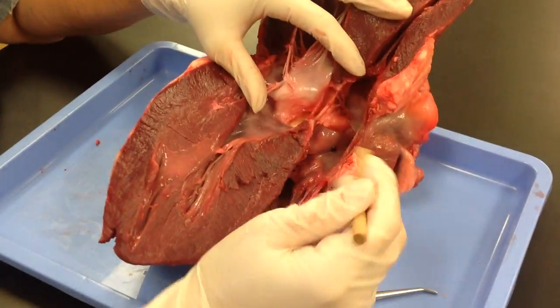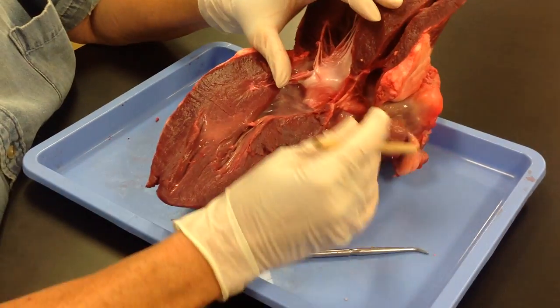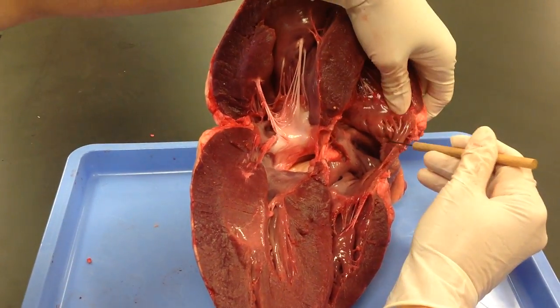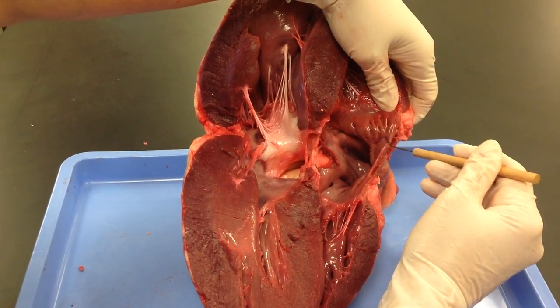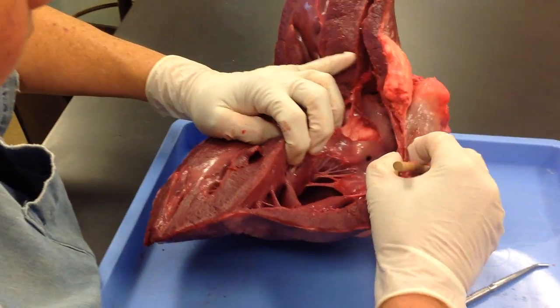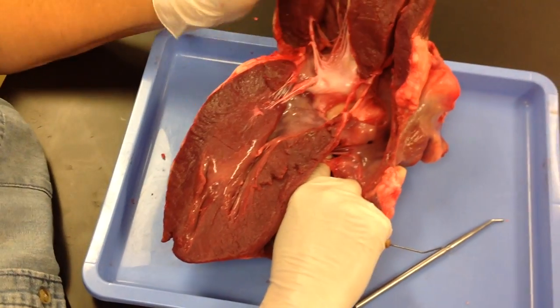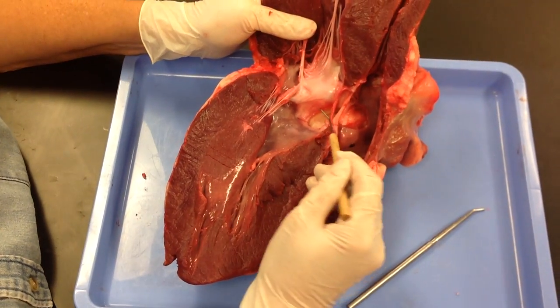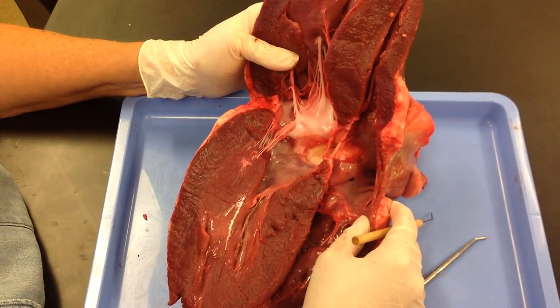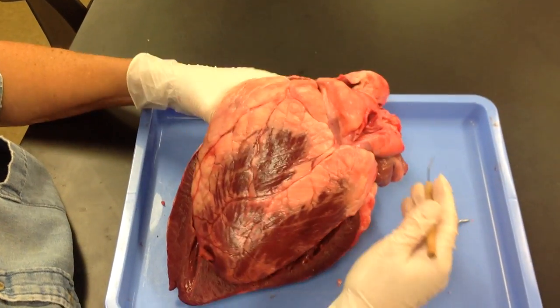On the right side, you have your tricuspid valve and papillary muscle. You have your right atrium up here. This atrial wall has pectinate muscles that help it with its contraction. The pulmonary semilunar valve is down below here, and it would look similar to the aortic with this type of flap of tissue. That is about it — that is your typical mammalian heart.